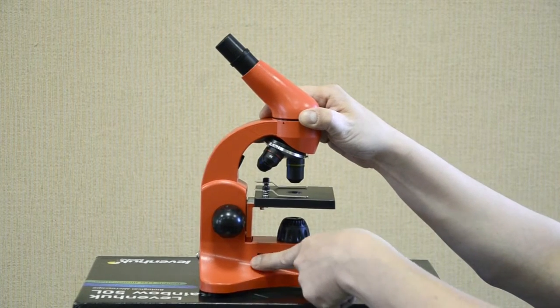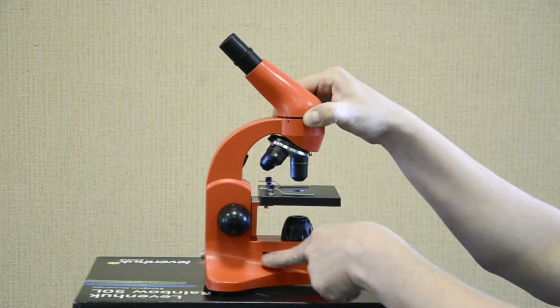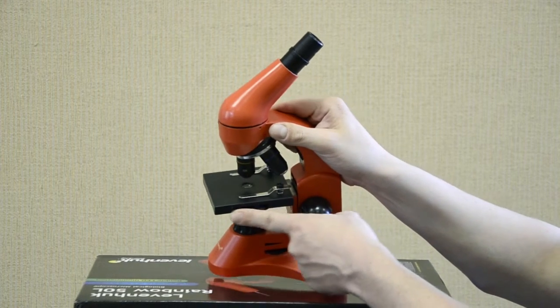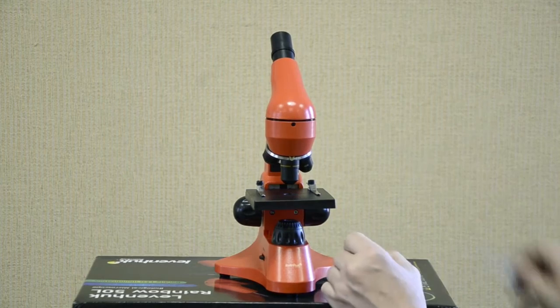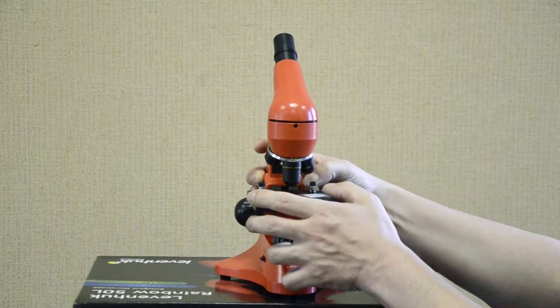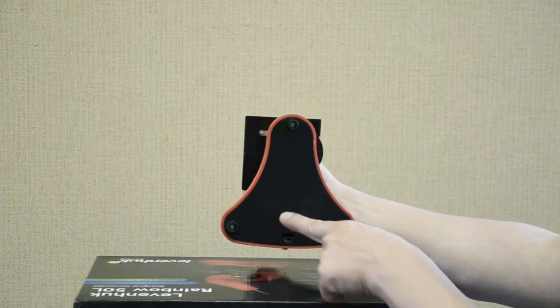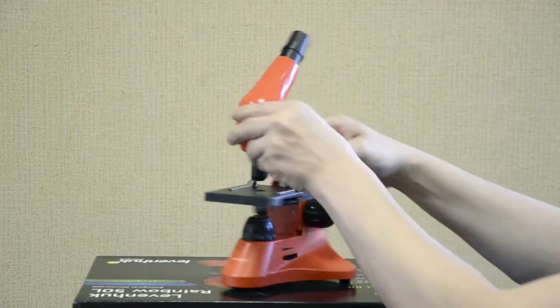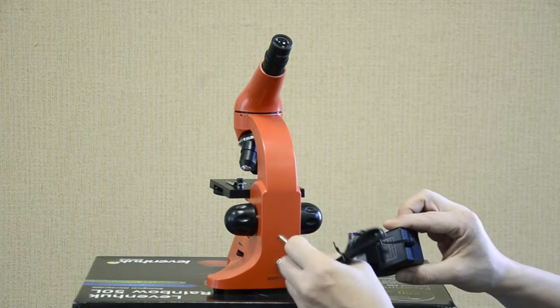Here's the lower illumination with adjustable brightness. The upper illumination can also be adjusted. We rotate the diaphragm disc to change the light beam. Here are the slide holders. The microscope can be powered by two AA batteries or an electrical outlet. The AC adapter — 110-volt or 220-volt depending on the country — is included in the kit.